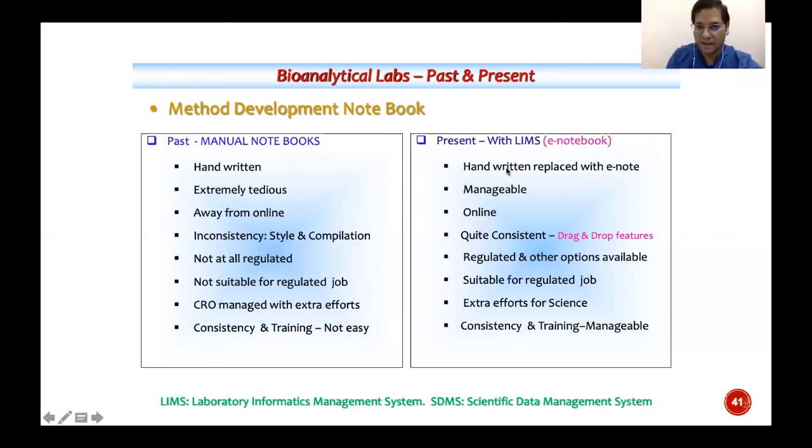When I talk about today, the handwritten work can completely be replaced with an e-notebook, a kind of automation. There, I need to write not even 10%. Maybe I need to sign digitally, and I can sign it off. Even there, I don't need any handwritten signature. Those kinds of solutions are available. With the e-notebook, what I used to do by handwriting for most of the experiments, documentation and presentation to my supervisor can be 100% replaced with the e-notebook through automation.